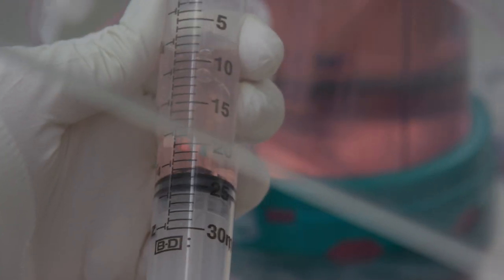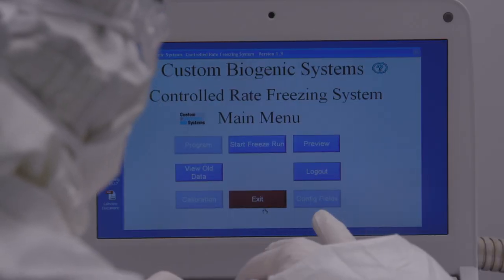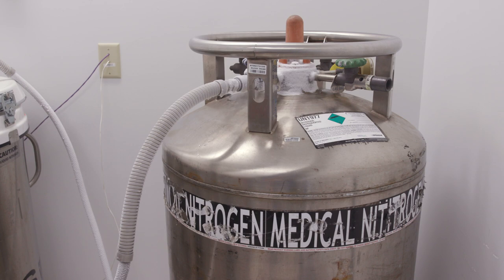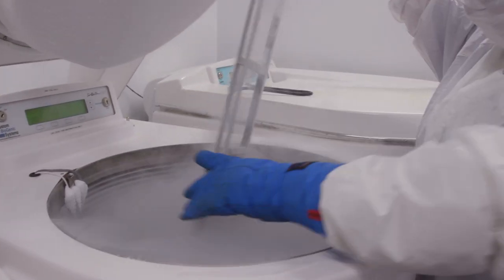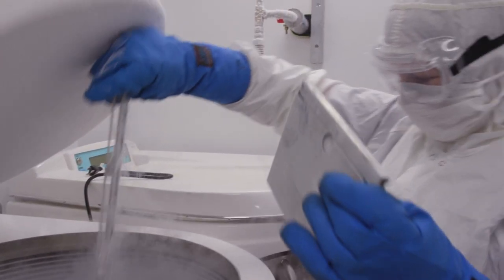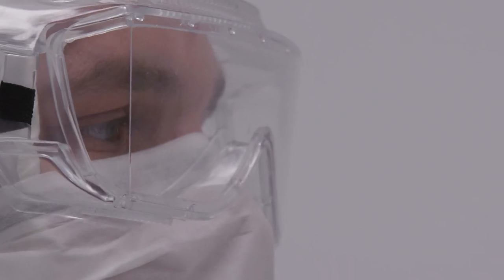Specially trained professionals store many clean room products in freezers cooled by liquid nitrogen. When needed, teams thaw and prepare these products for treatments and research.